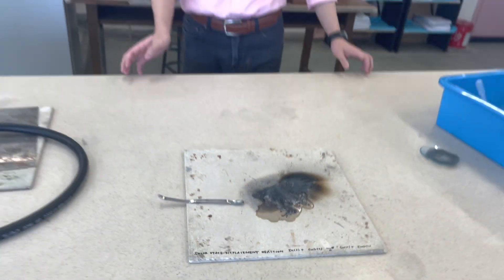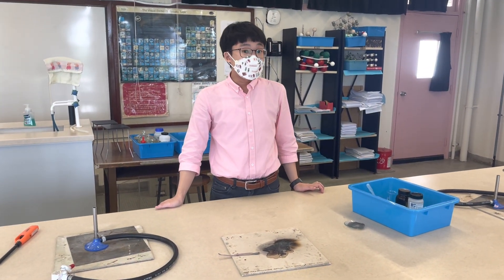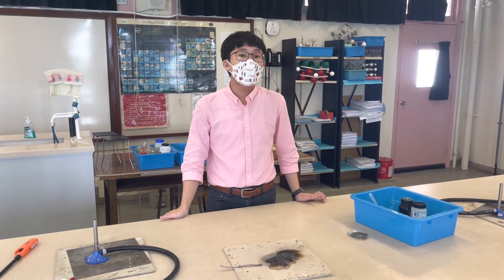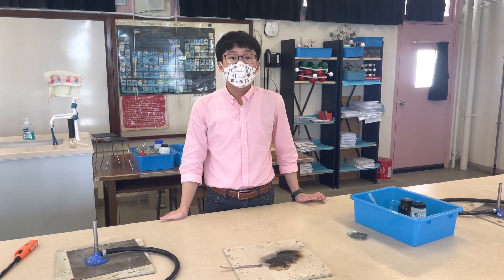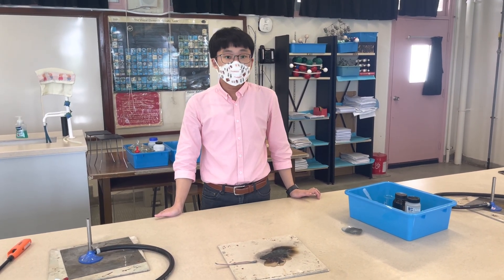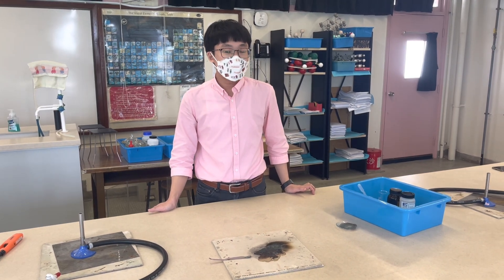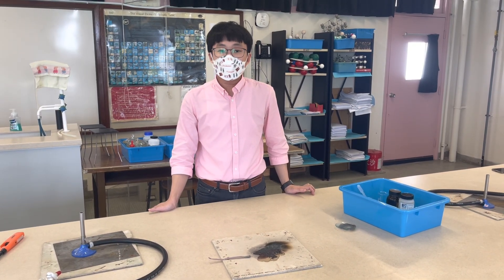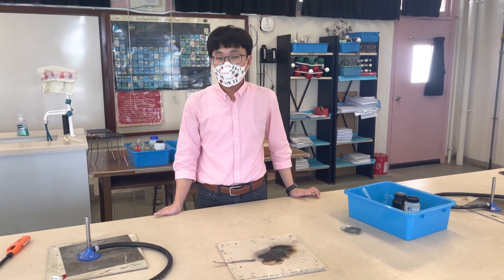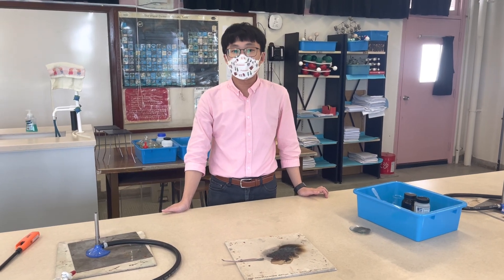Have a very nice day. I hope you observed the few important observations: the flame color when we ignited it — what was the flame color and why there was a blueish-green flame — and also that when the mixture was hot it had yellow solid as well as reddish-brown solid, and after we added the hydrochloric acid to dissolve the zinc oxide, we could see the copper metal. Thank you and have a very nice day!